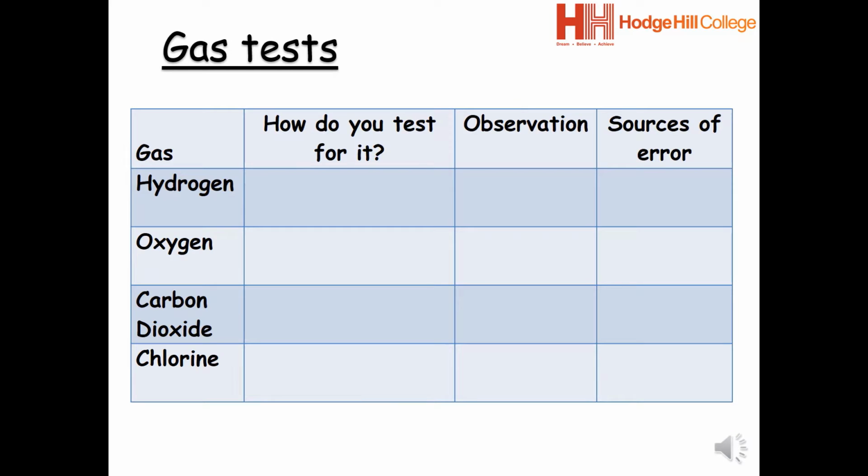Before I begin describing the gas tests, I want you to pause the video and create this table. As I'm doing the different gas tests, I want you to write the method for the test, the observation, and the possible sources of error.